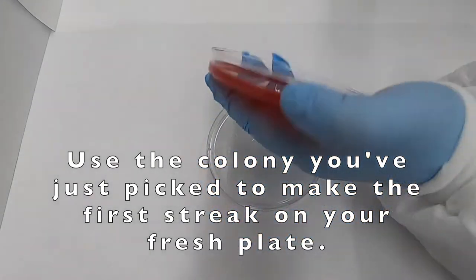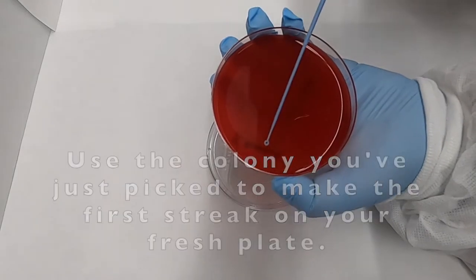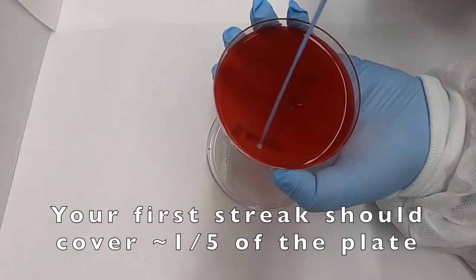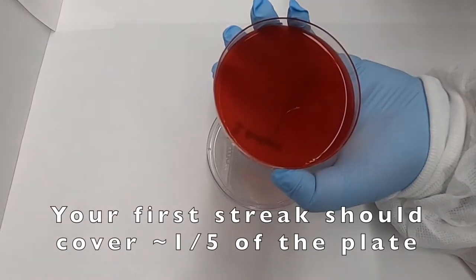We then use our loop with our single colony to make our primary streak on our blood agar plate, and this primary streak should comprise approximately one-fifth the total surface of the agar plate.